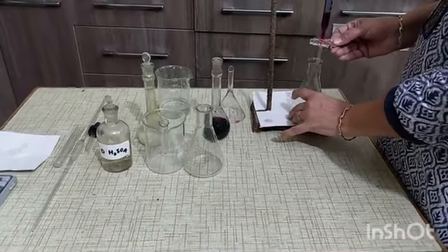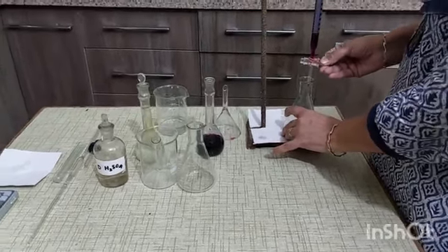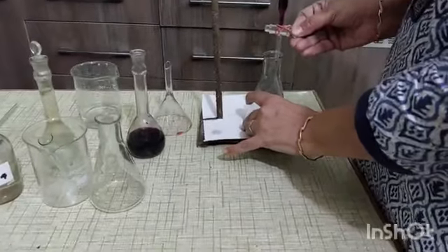Maintain the level of KMnO4 up to the 0 mark.